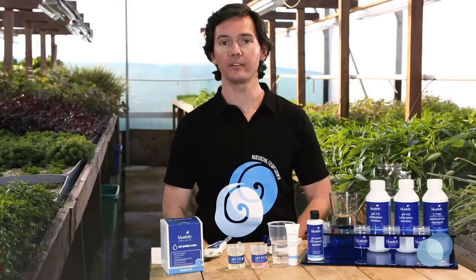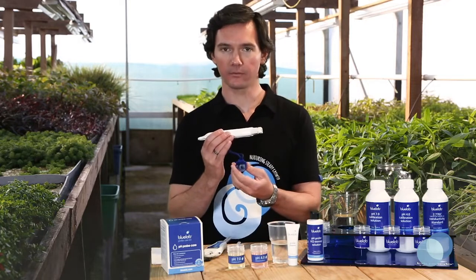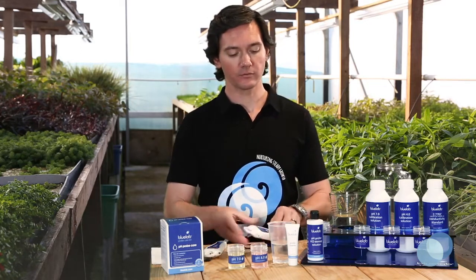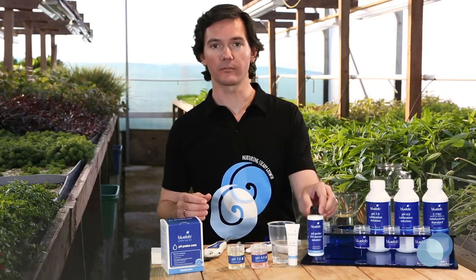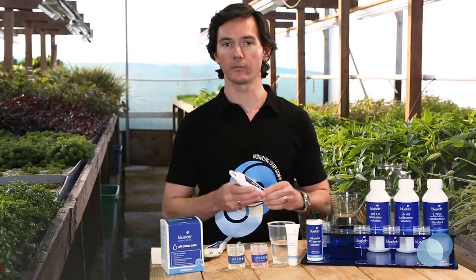Always ensure that your Bluelab PH Pen probe glass tip is kept wet. To store your standard PH pen, check inside the storage cap and look for the foam insert inside the bottom. Check it's dry, then just add a few drops of Bluelab PH Probe KCL storage solution to the foam. Simply put the cap back on and you're ready to store it.